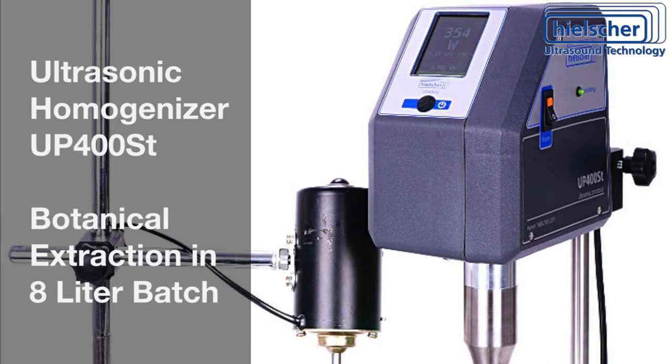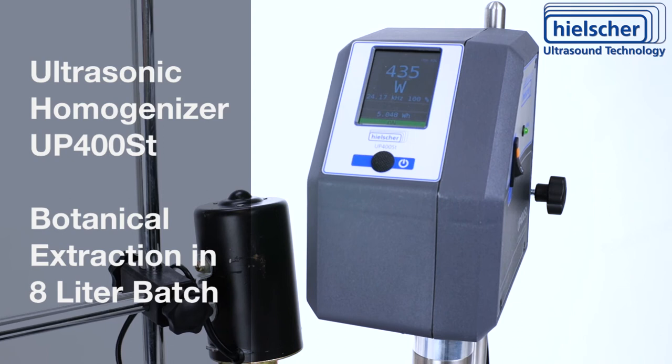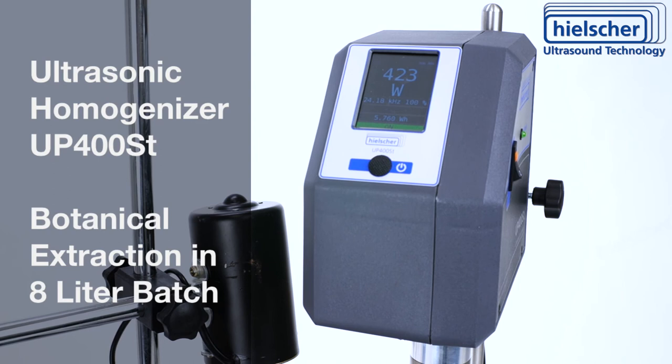The UP400ST is easy to operate. All sonication parameters are adjustable using the colored touchscreen. Every sonication run generates a detailed protocol on an SD card, so that you have a record for every batch you make. This is important for process validation and quality management.